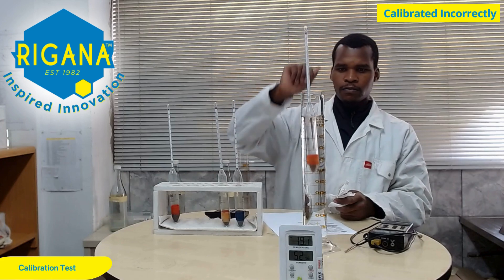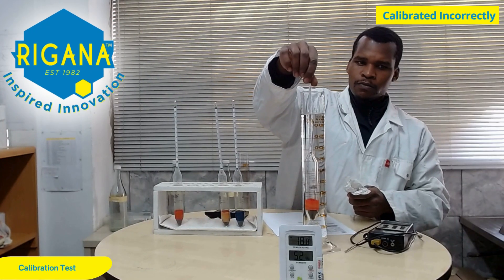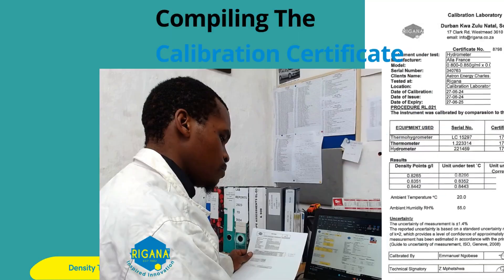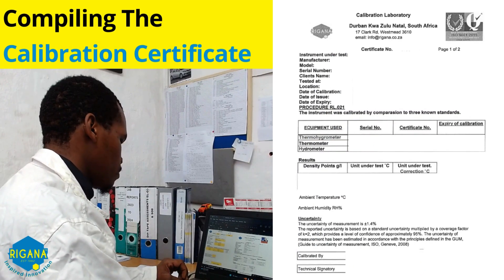Hydrometers that are out of range for the liquid being tested will either float or sink. Once the test is completed, the technician will compile the calibration certificate.